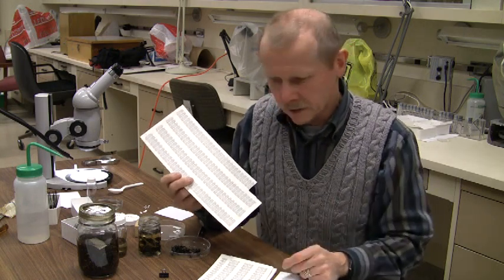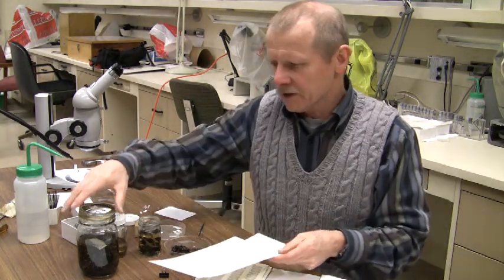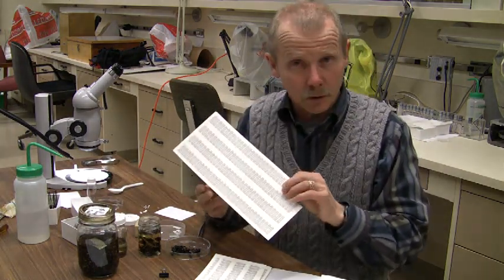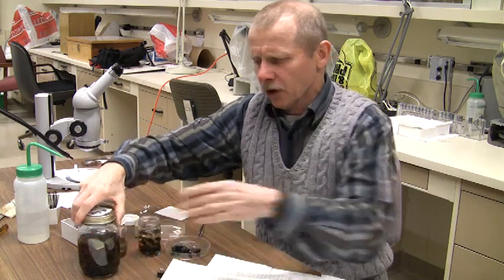These labels will be used by you and your partner for labeling the specimens that you have. You will have all read the handout, so you'll know that each one of you will be given a lot number, which is associated with the label. Each of you will also have three jars of insects.